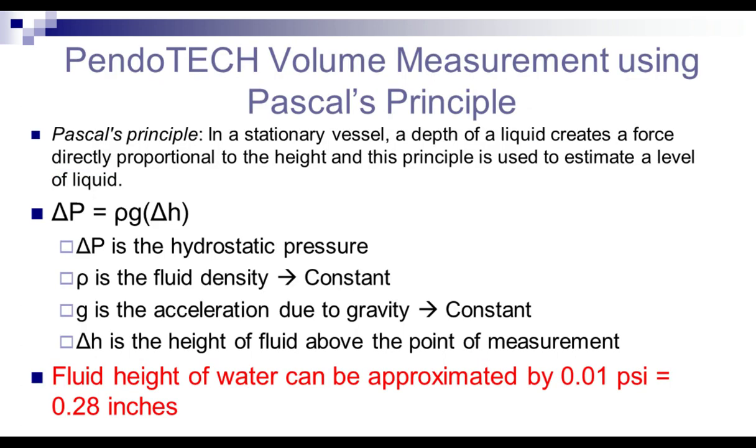All of this is based on Pascal's Principle. So we used the idea that the liquid level can be accurately determined from a pressure value based on Pascal's Principle, which states that the depth of a liquid in a stationary vessel creates a force directly proportional to the height.